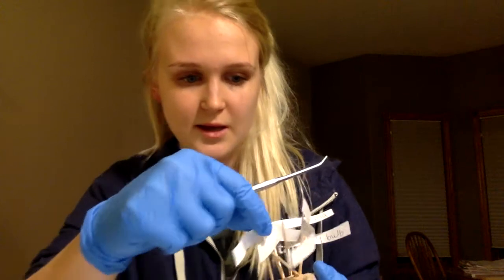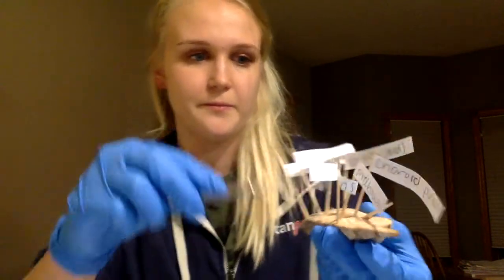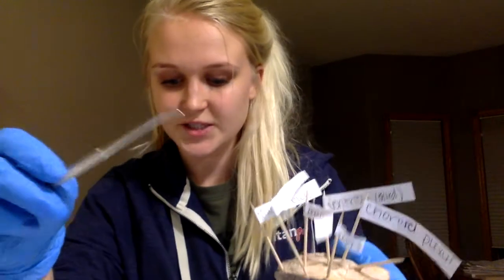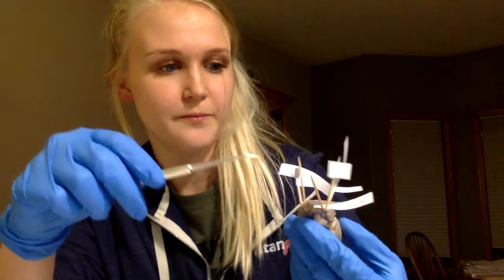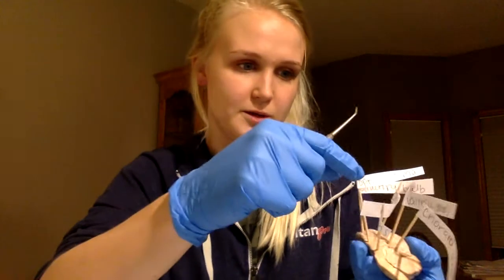And the midbrain is located between the pons and the diencephalon, located right here. The pons are located anterior to the medulla, and this contains nerve tracts that connect the cerebellum with other parts of the brain and spinal cord. The pons are located here, the lower part of the brainstem also.